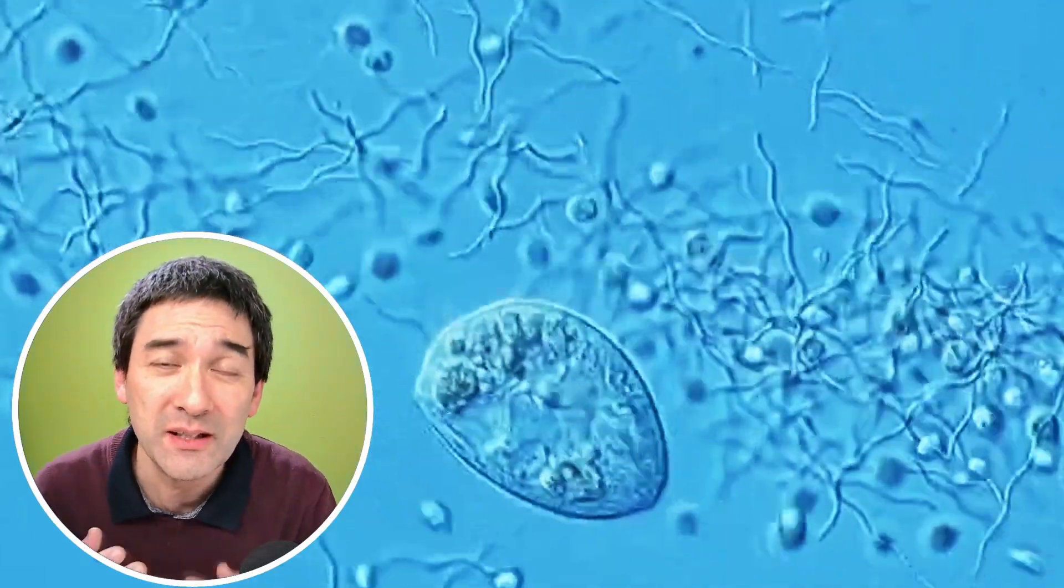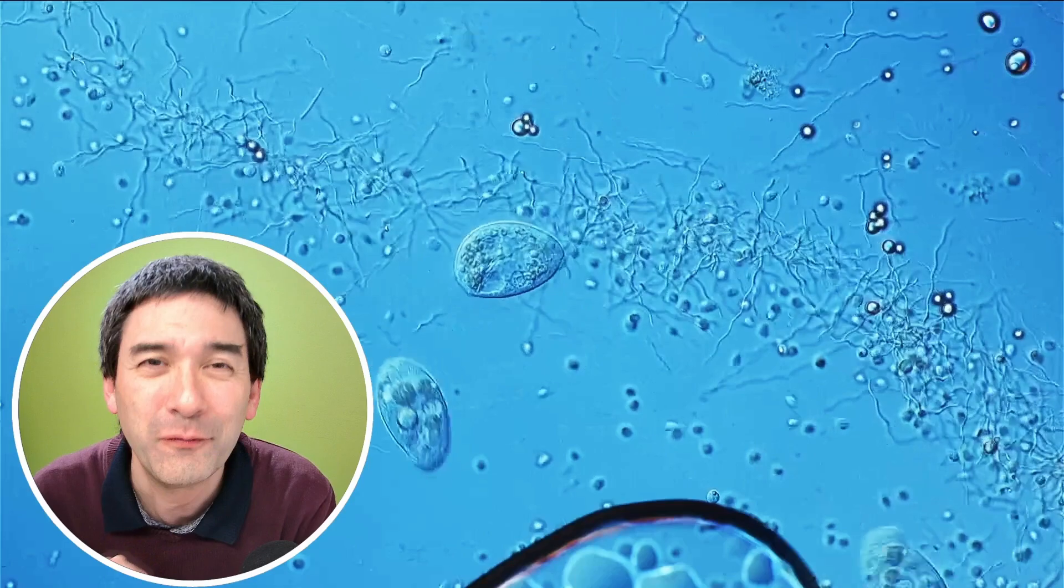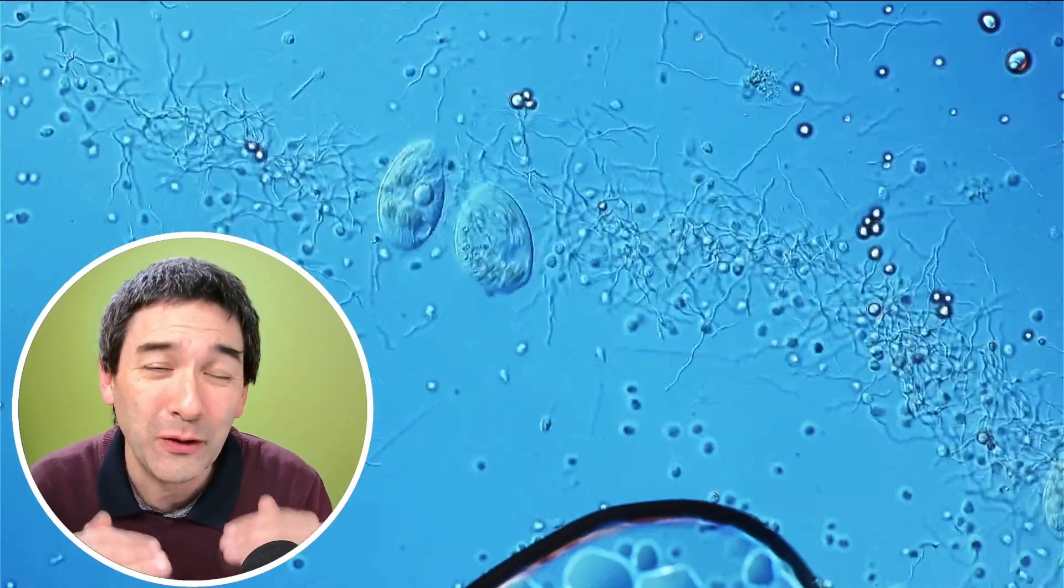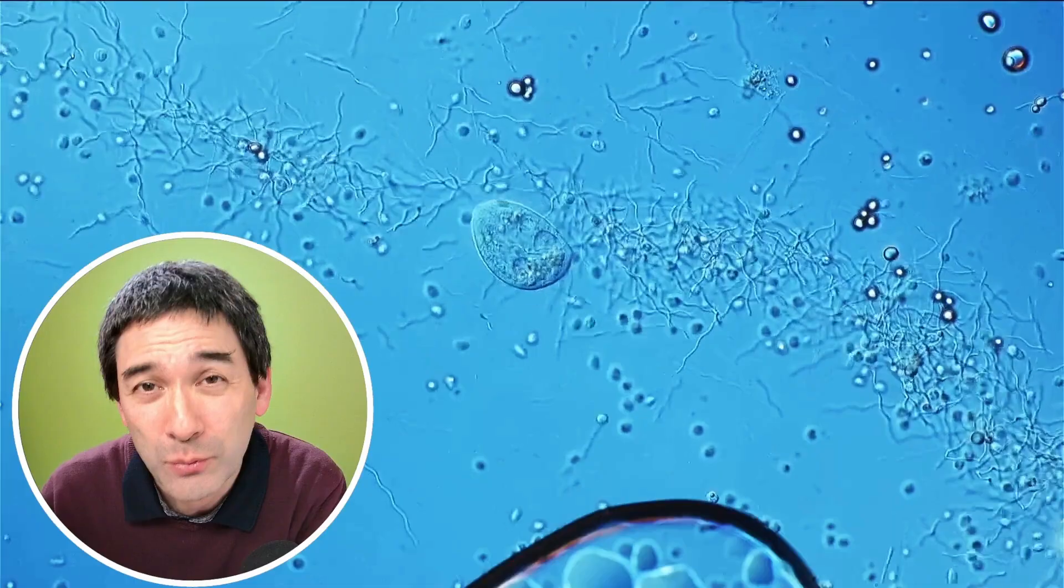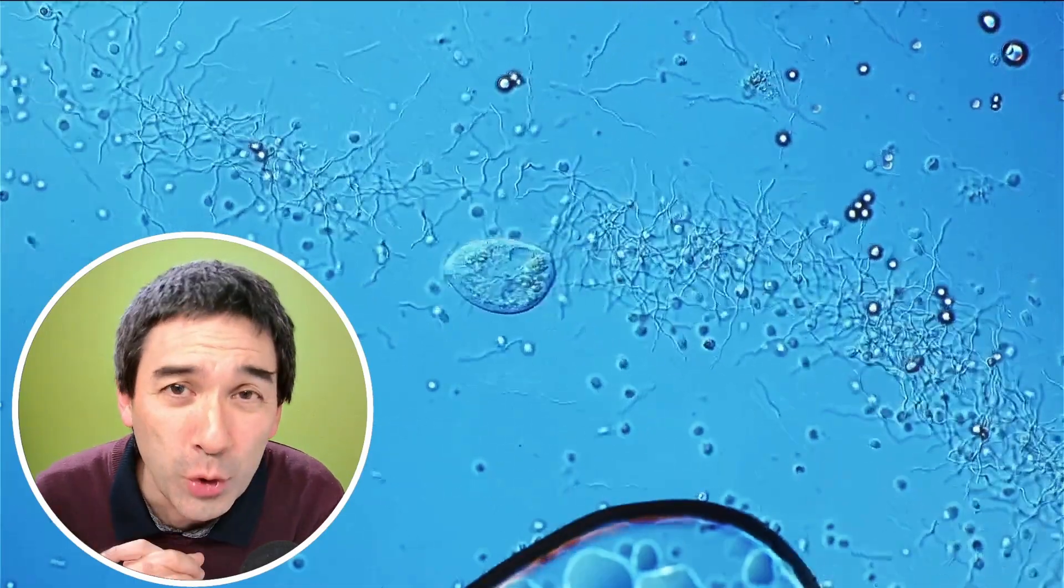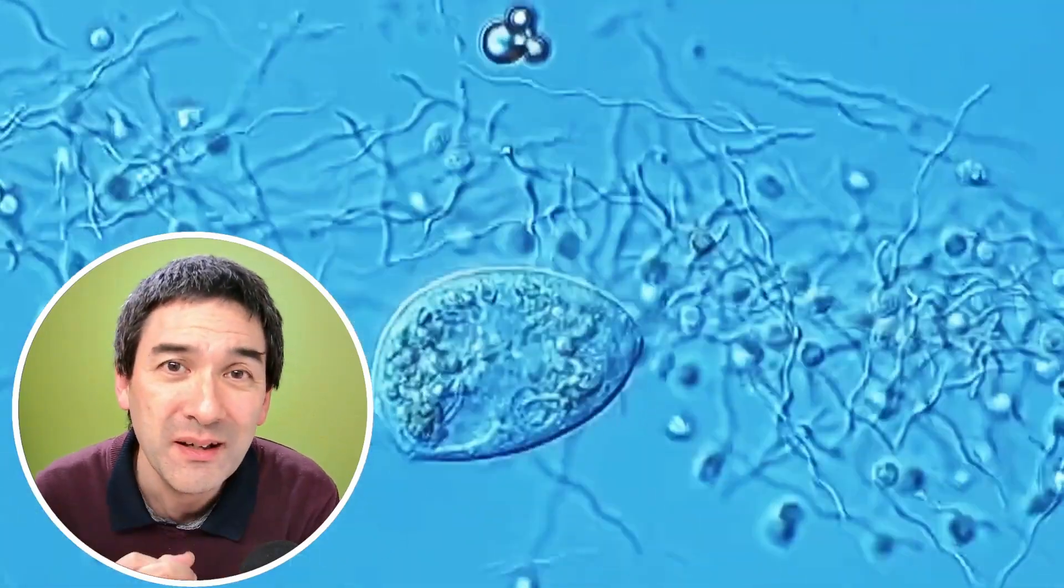And I can imagine that this is also the case here. I simply did not follow them sufficiently long to actually see them move along. But this is indeed something that I've already observed in the past, that they actually move towards the edge of the cover glass because this is where the oxygen concentration is indeed the highest.